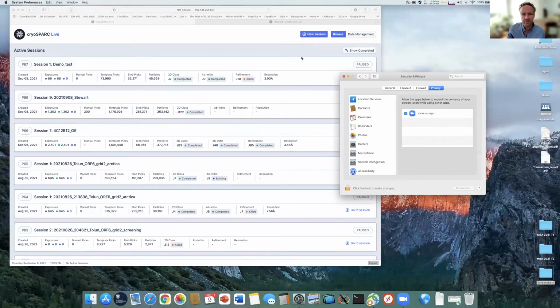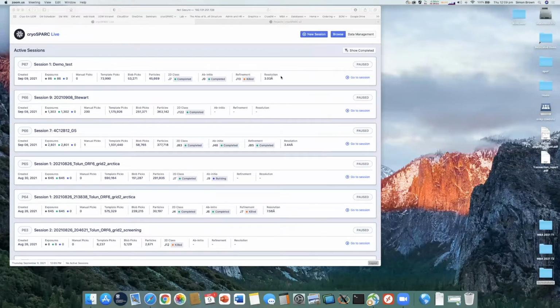Oh gosh, my Mac is asking me to do some stuff here. Give me a moment. Okay, is that sharing for you guys? Hello? Yes, we can see it. You can see it? Okay, great.